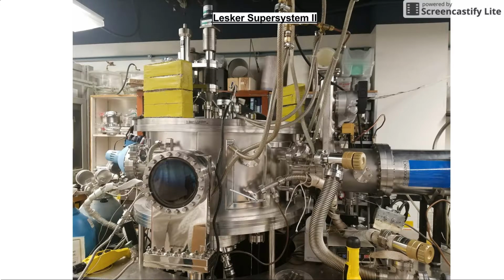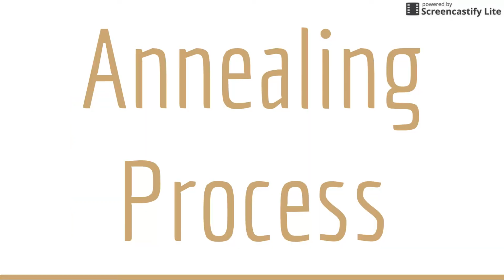For this deposition, a nitrogen-rich vacuum environment was created in the chamber. To deposit the silicon nitride layer, 100 watts was supplied to the plasma gun for 5 minutes. For the silver-copper layer, each of the 2 plasma guns were given 100 watts of power for 6 minutes. The copper and silver were simultaneously deposited onto the wafer.